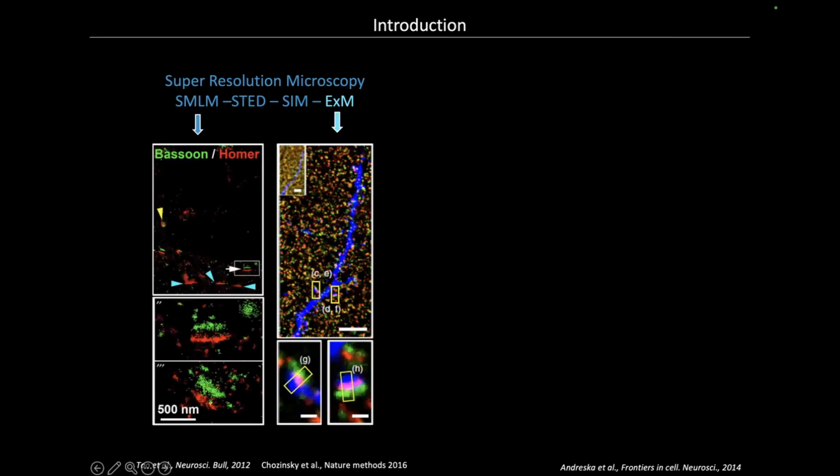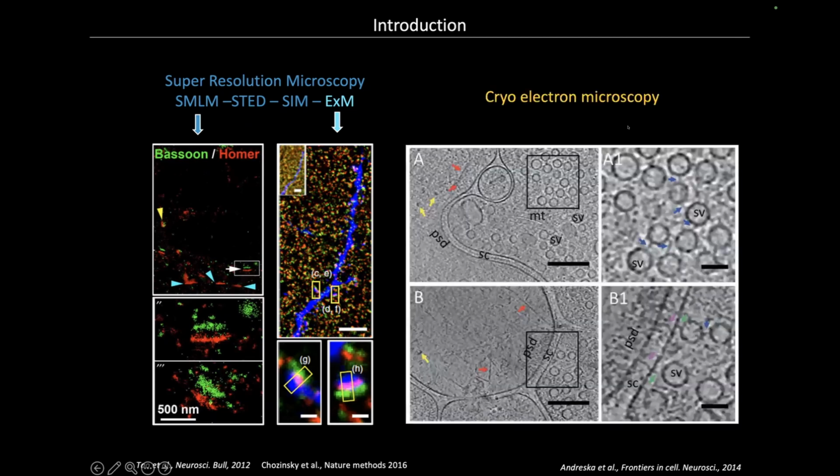Here I'm just re-showing, but I know the topic of expansion itself was very well covered on Friday. Just to keep an element that people have looked at a lot, either by super resolution, the synaptic contact, and by expansion. And I would like to compare this light super resolution microscopy with electron microscopy, using electrons, as its name tells.